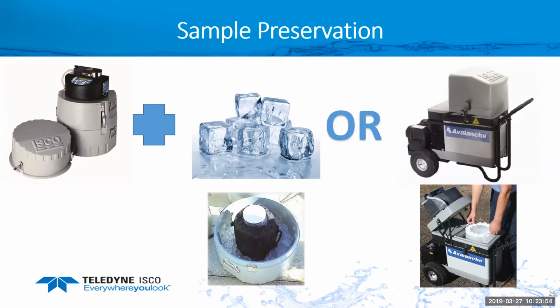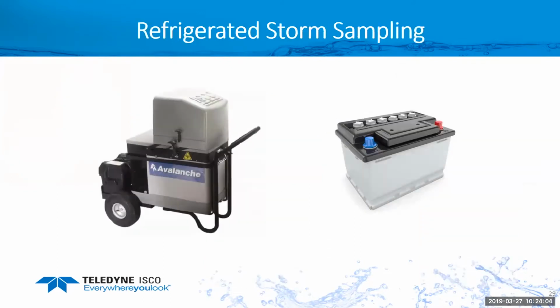Then when the refrigeration cools the samples, it keeps them at 4 degrees C until it can be retrieved. Typically that's within 48 to 72 hours of the storm. So the refrigerated sampling is a lot more convenient and a lot safer for your field crew, because they don't have to be out there just before the storm starts and may get caught in the storm. This can just sit out there.